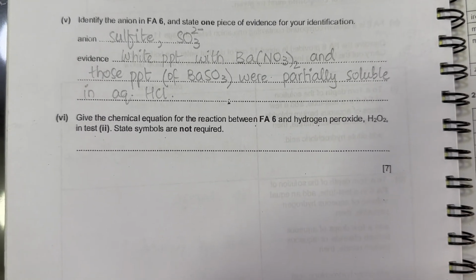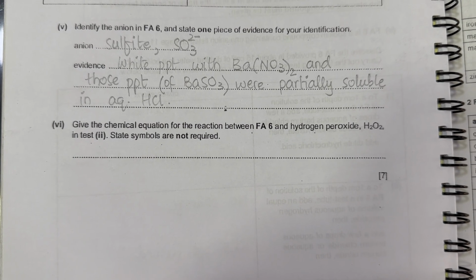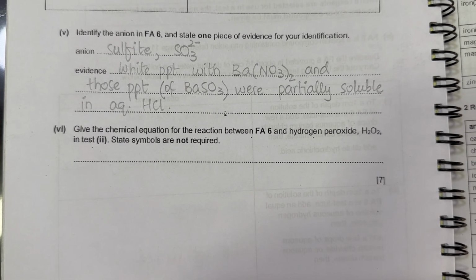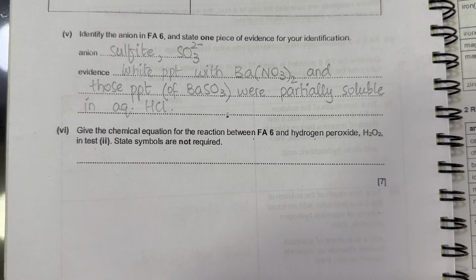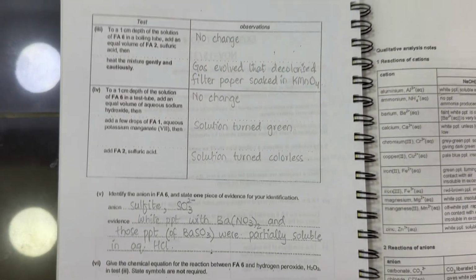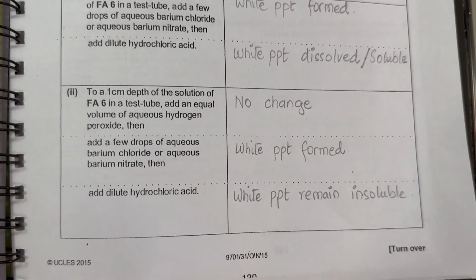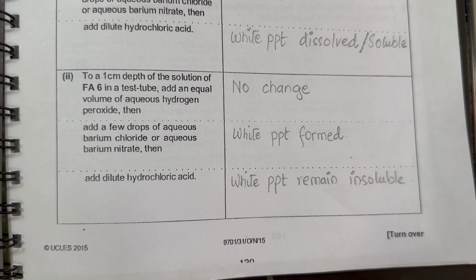Now let's proceed on to the next part, where they say give the chemical equation for the reaction of FA6 and hydrogen peroxide in test 2. State symbols are not required. Now in part 2, we have added hydrogen peroxide in FA6.